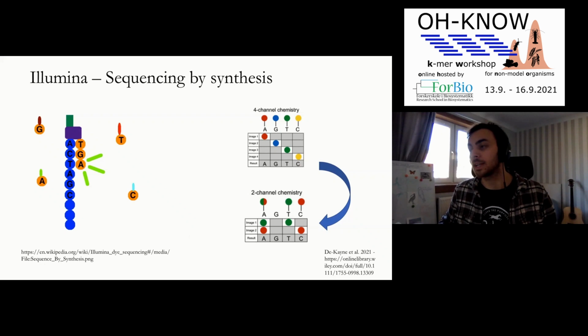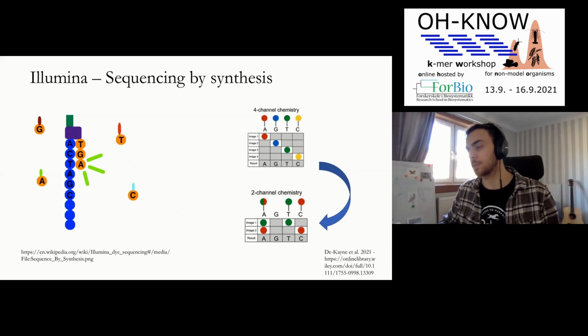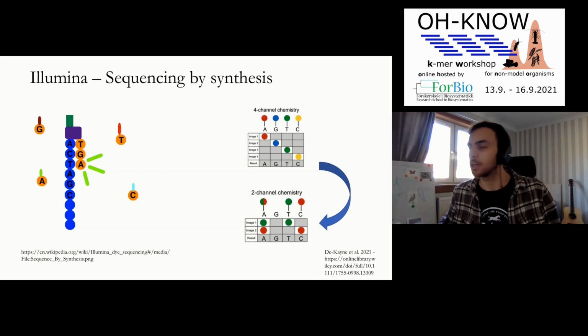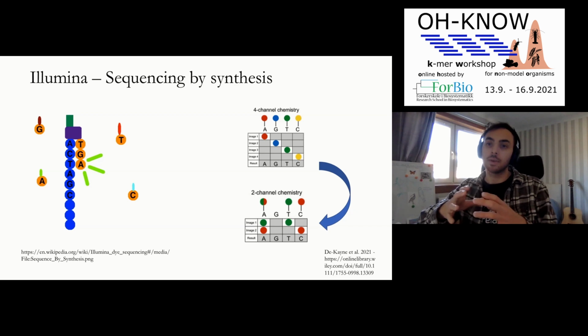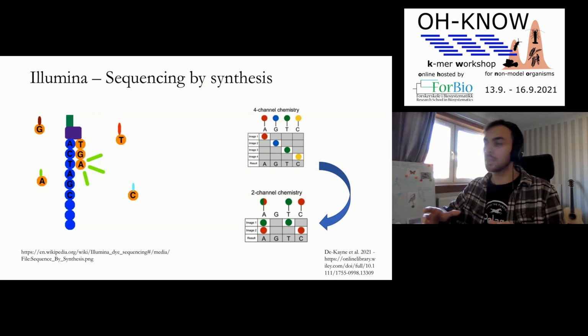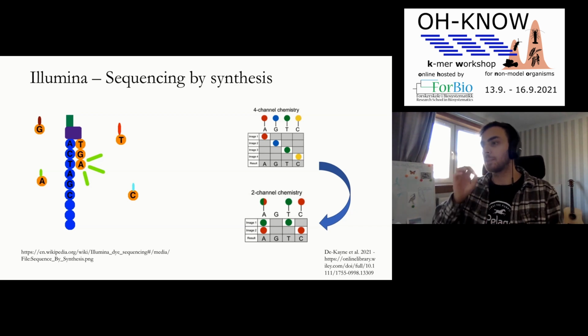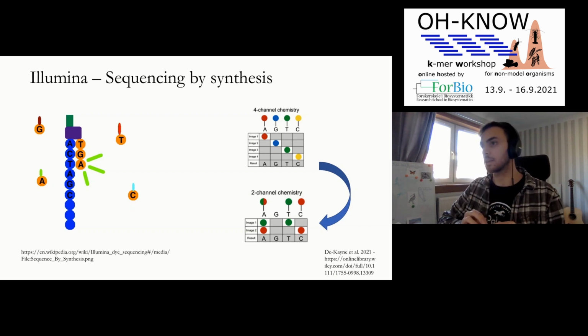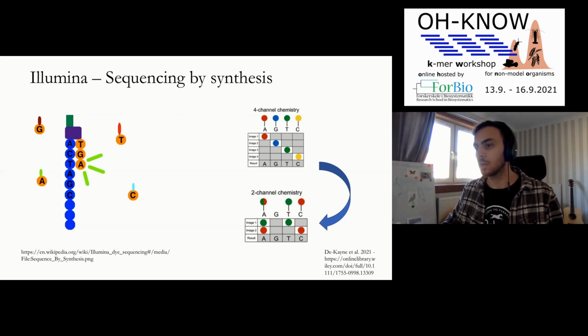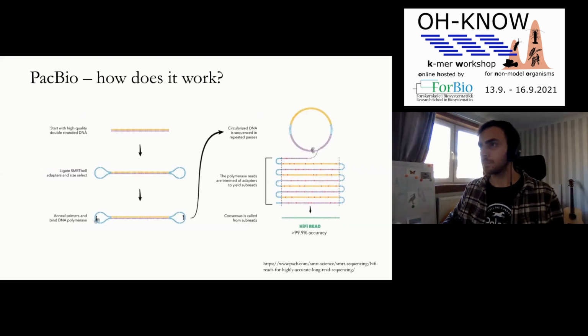And so if you're combining data across platforms, this is especially important to bear in mind because one G call does not equal another across your samples. But essentially what Illumina managed to do is they have these patches of sequence, and the patch basically allows the machine to pick up that fluorescence in a much higher quantity. So it's not a single molecule that's emitting these photons, but it's actually this whole clump, which allows them to more accurately call the nucleotide for you.